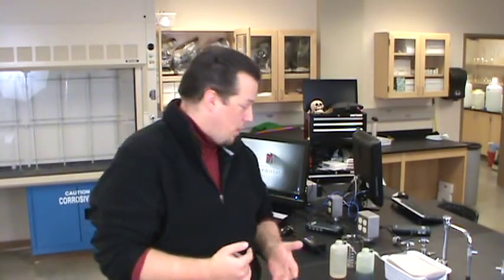Of the many properties of chemicals and physical systems, one that's usually fairly easy for us to think about and to measure is color. The way we're going to measure color is by using an instrument called a spectrophotometer. The spectrophotometers we have in lab right now are very good at giving us not just an idea of what the color is, but some very quantitative aspects of color.